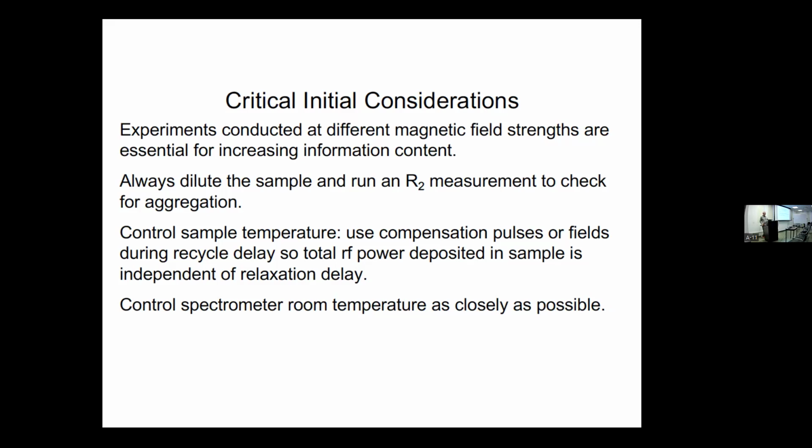You have the sample in solution that's thermostated by the VT air and the sample heater. And now I said we can turn on this T-lock, which helps stabilize the temperature even more, but still the room temperature matters. So keeping it stable. But why would a stable room temperature matter if we can thermostat the temperature of the sample very well?